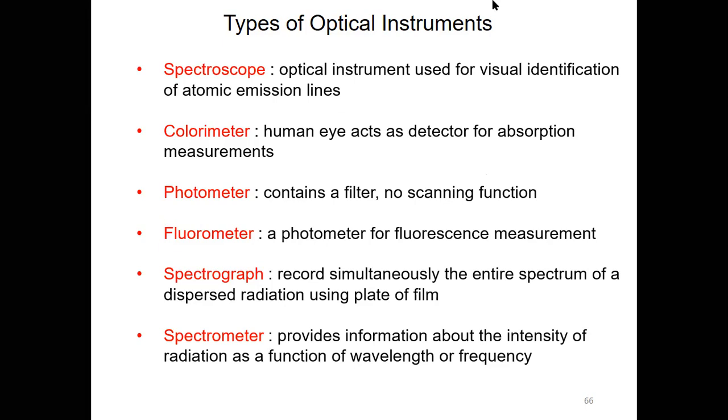Okay, if there's no question, next I will discuss briefly the mass and GC and a little bit of the HPLC. I will not explain much detail. In the mass also, I think you already learned mass spectrum, but you have not learned the instrumentation part. Have you learned the instrumentation part under mass spectrum, like the detectors and the mass analyzers, all these things?